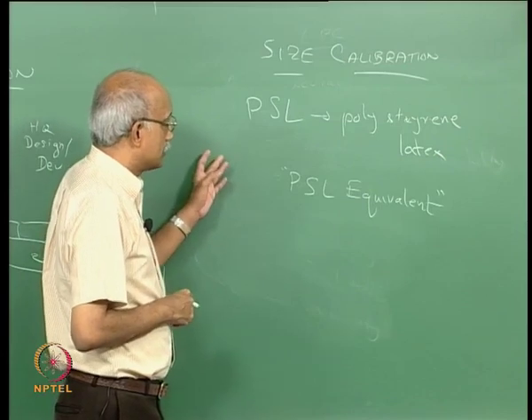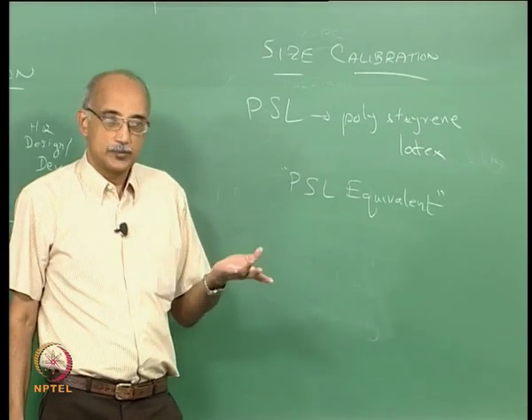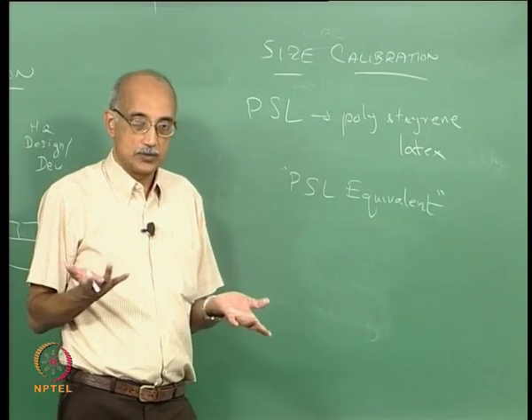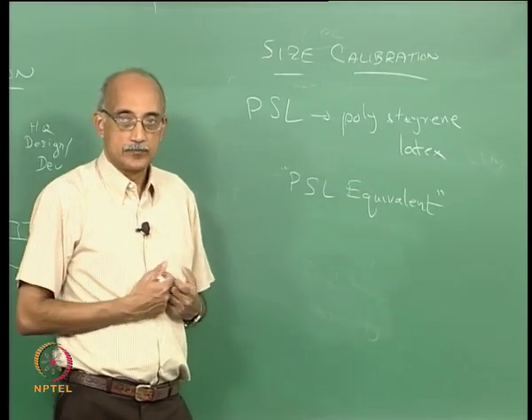So, let us say that you know that your sample is predominantly ceramic. How should you calibrate the instrument? Is it okay to use PSL and accept the fact that there is going to be a large deviation between the actual value and the measured value, or do you try to calibrate your instrument with a different standard?